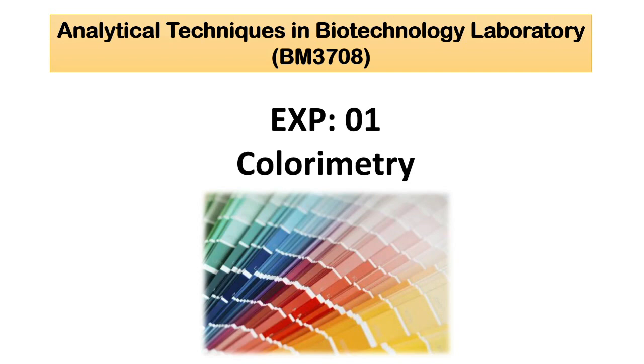Mechanical testing will be there. Then we will look into the moisture content analysis. Then different microscopic techniques. We will see how bright field microscopy is different from dark field microscopy, which is again different from polarizing microscopy, and what information they give you. Then we will look into the operation of the multiplate reader, how the multiplate reader functions. Along with that we will be looking into other things also. So these are some of the major experiments we will be discussing.